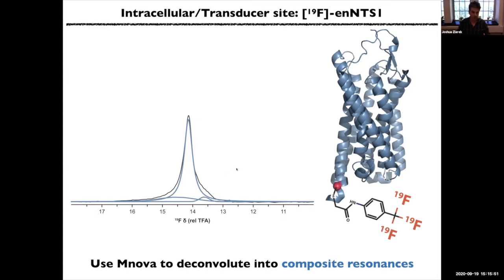Thermodynamically they're different, and they seem to have different kinetics. So yes, we see evidence of allostery by that definition. We just don't know any mechanism for it at this point in time. I don't know if that answers the question or not.